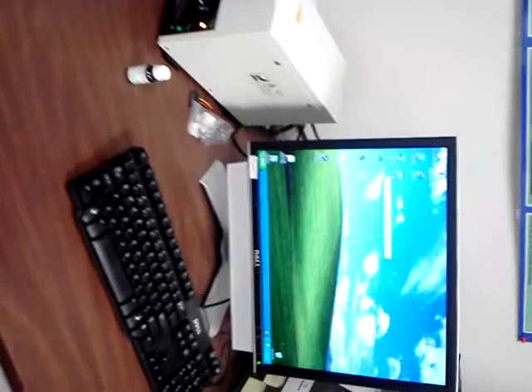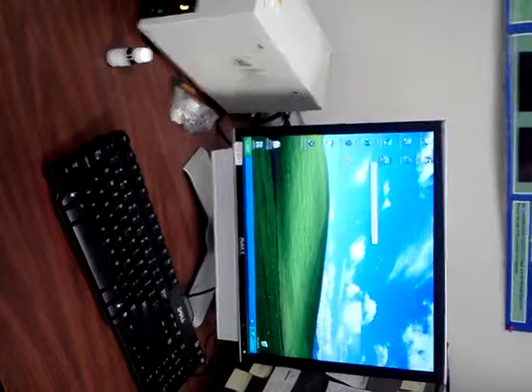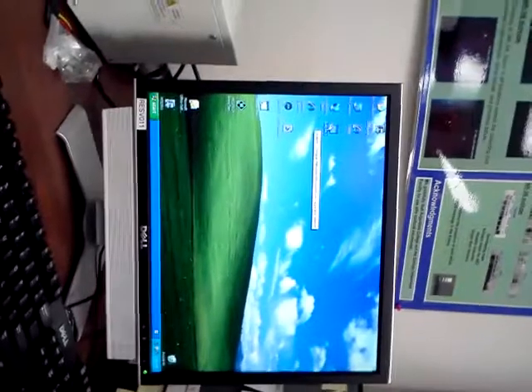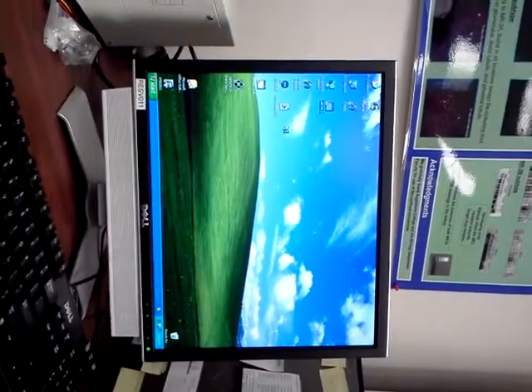Just know that it's right here, LAS V 4.3. Now, if somebody else logs on, it may not be sitting on the desktop, so that's why we may have to go to the program, which would be in the computer. It may not be sitting on another person's desktop. Well, all users just make a shortcut on their desktop. Okay. So I'll go into this.